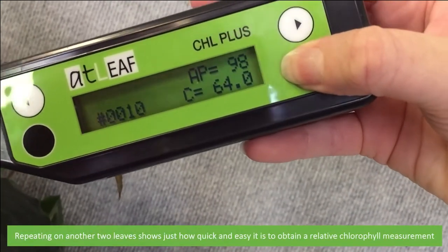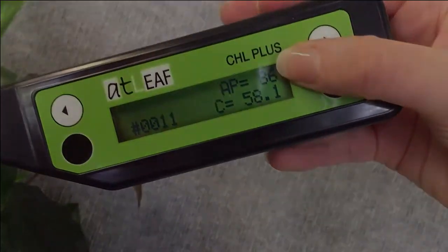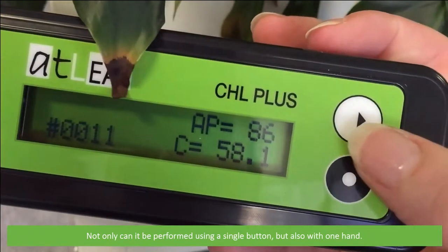Repeating on another two leaves shows just how quick and easy it is to obtain a relative chlorophyll measurement. Not only can it be performed using a single button, but also with one hand.